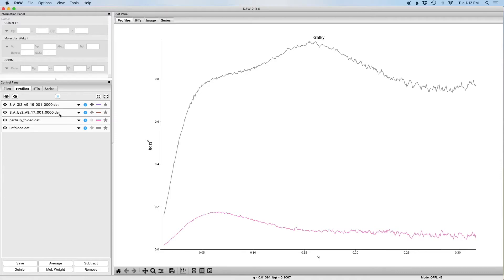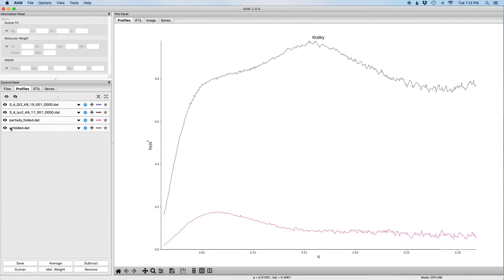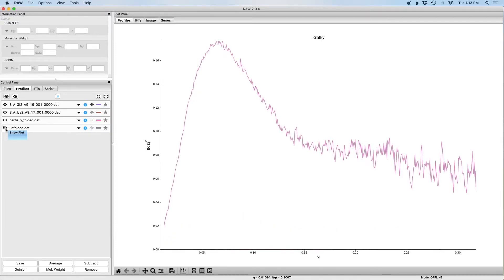So in order to see them all in the same plot here, what we need to do is apply a scale factor to scale them back down. So the first thing I'm going to do is I'm going to hide the unfolded data like so, so now we're just seeing this partially folded data.